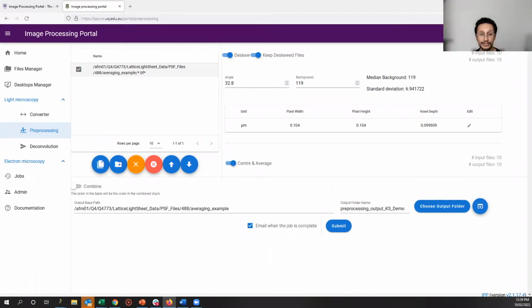But it's easy to take the data from the Zeiss machine and start using open source equivalent tools. Has anyone done any testing on that in terms of whether they get similar results, or is it deterministic? Or you can definitely take it to open source tools. The bottleneck that we see is Bio-Formats. If you're relying on Bio-Formats to open a terabyte file into Fiji, it's going to take you half an hour because it's not written for high speed opening.